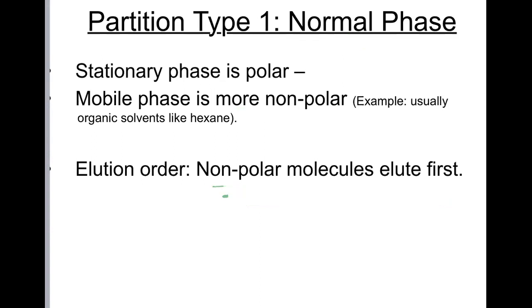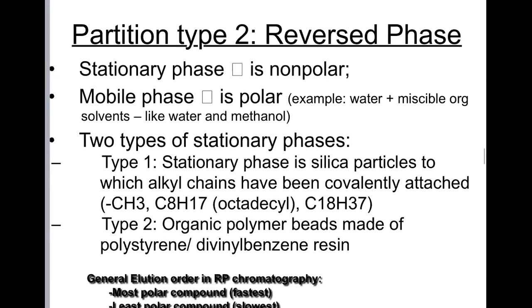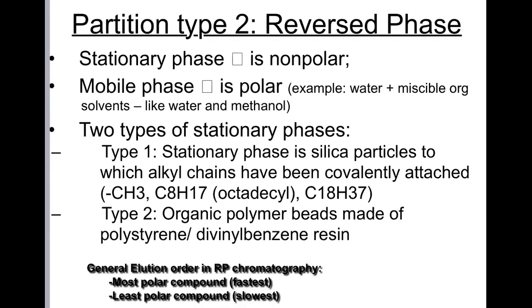It's pretty simple. Now, the other type of partition chromatography is called reversed phase chromatography. In this type, the stationary phase is non-polar. So we reverse things up and we make the mobile phase more polar. How do we do that? Well, we actually start with a very similar silica bead.